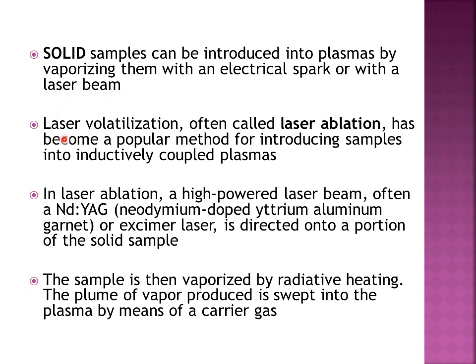Laser volatilization means by the use of laser. This method is also called laser ablation, and it has become a popular method for introducing solid samples into inductively coupled plasmas. And what happens in laser ablation?